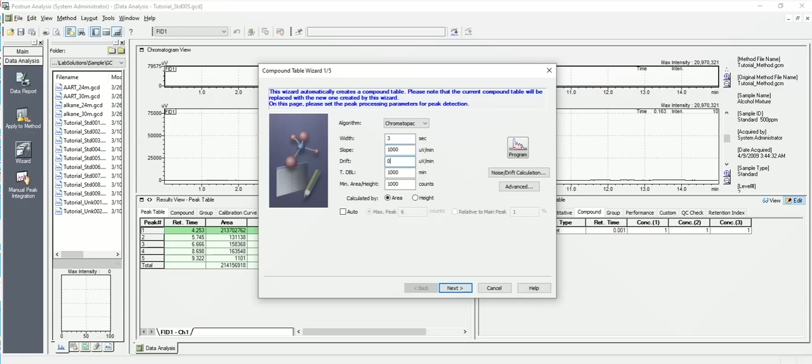Drift here, this is in instances where you have a baseline that rises over time, so you don't want it to drop down to a flat baseline, a horizontal baseline, you want to hit the baseline of the rise. So that would be your drift. We're not going to worry about that right now either. T double I'm not going to worry about. That's if you're running isothermal and the minimum area is just not to report specific areas below which, you know, small little peaks. We're going to use area, not height.